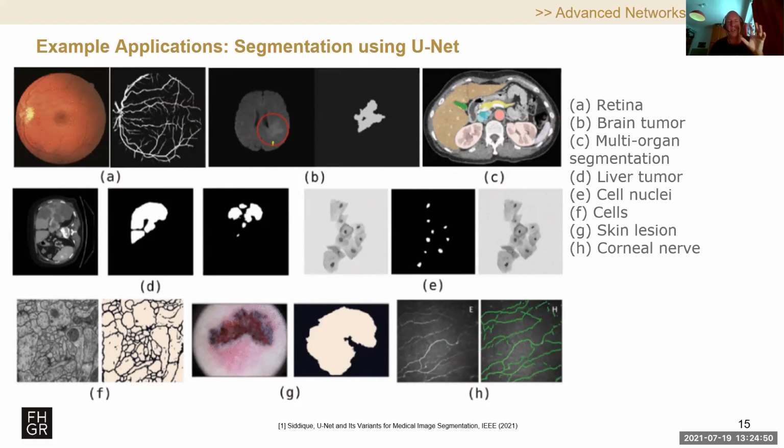So this is, let's say, a rather advanced use of neural networks, because you don't simply classify the image. You don't search for structures within the image, but you have a pixel relationship, which pixels belong to the interesting part. So this is called a segmentation neural network, and the UNet is a prominent approach for that.